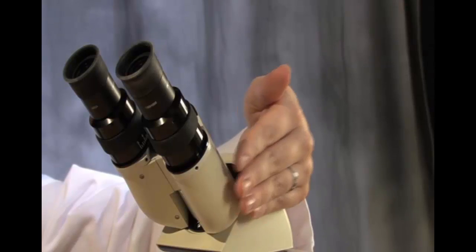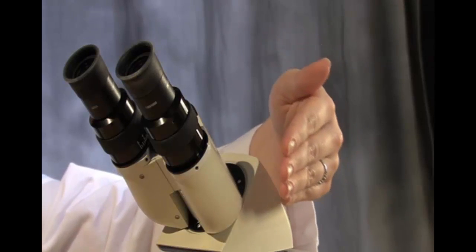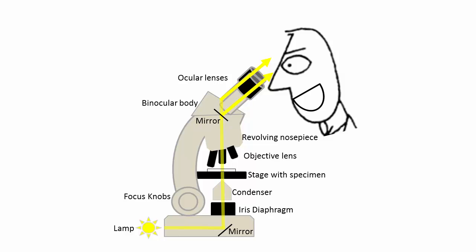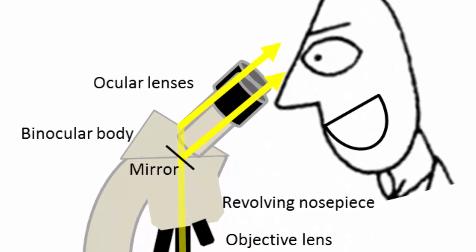As you work your way down the scope, we have the binocular body. The binocular body contains mirrors which will take a single image and split it to both eyes simultaneously.